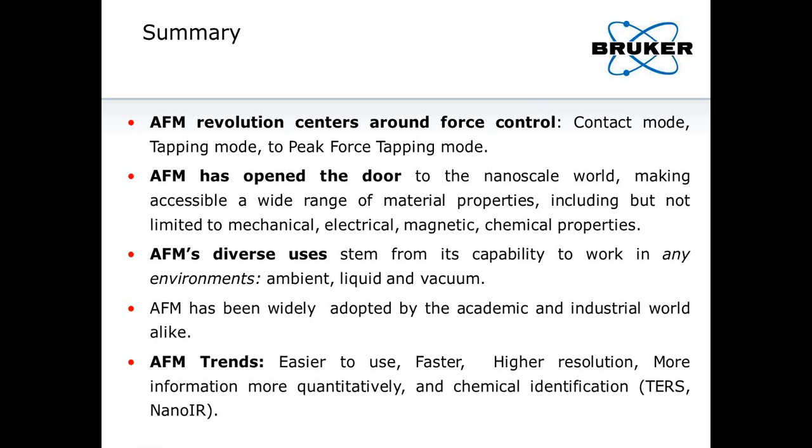For scanning capacitance microscopy, the resolution is on the order of, let's say, 20 nanometers. I know there are efforts going on to make the resolution higher. For those small structures, the more suitable tool will be scanning spreading resistance microscopy, and the resolution can go down to 1 nanometer, a few nanometers, which is in line with current semiconductor device resolution.